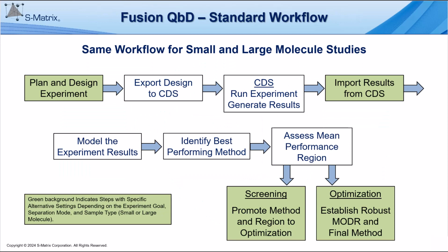This slide shows the standard method development workflow in Fusion QbD. You execute this same general workflow for all your method development work. The steps in the green background indicate specific alternative settings depending on the experiment goal, the separation mode, and the sample type, small or large molecule.